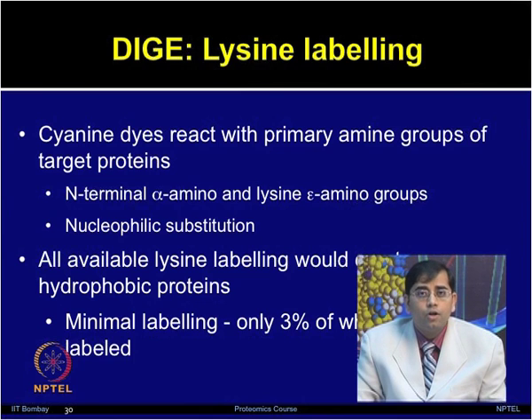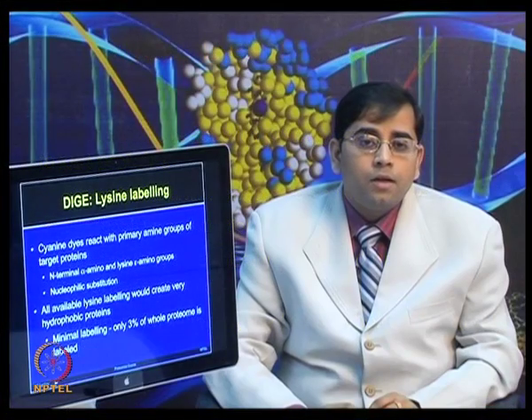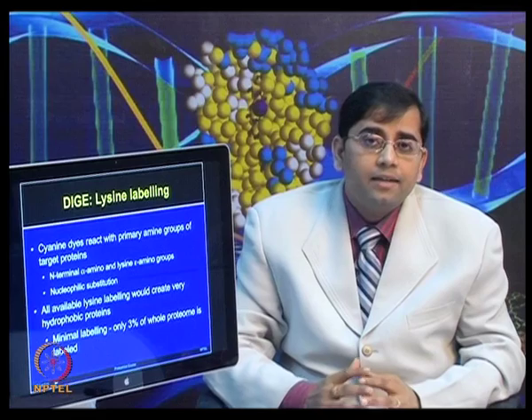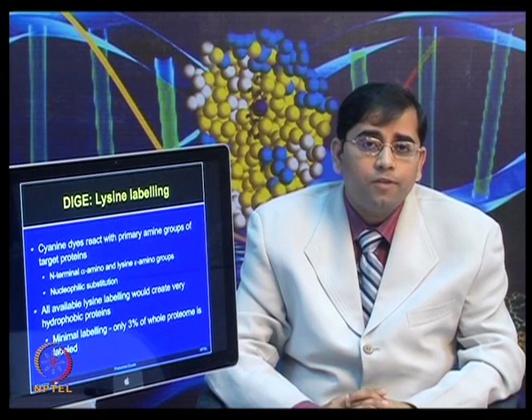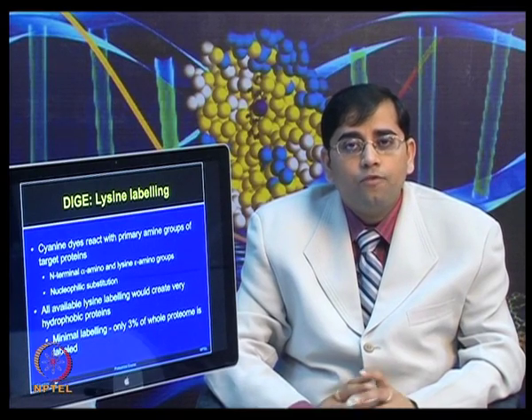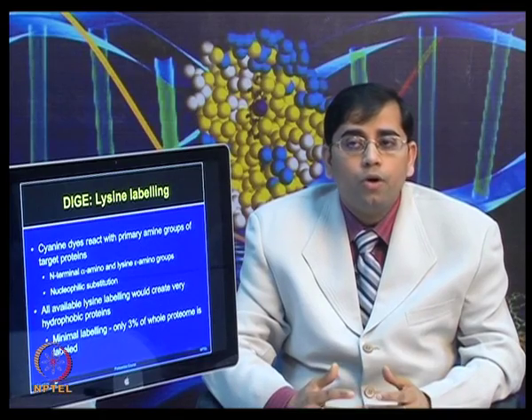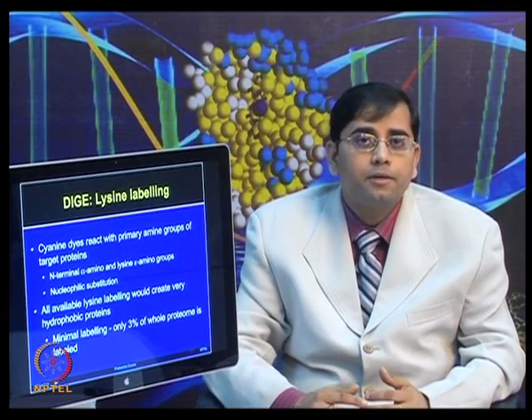That was the case observed by the original paper by Unlu et al. So, to avoid that hydrophobic protein atmosphere, it is recommended to do the minimal labeling of only 3% of the whole proteome, so that overall it is not very hydrophobic.